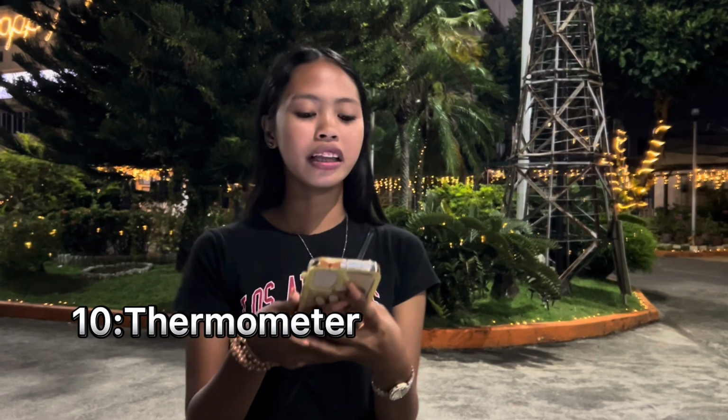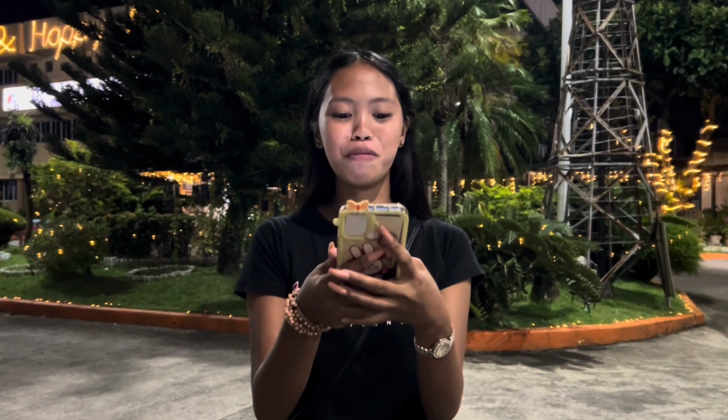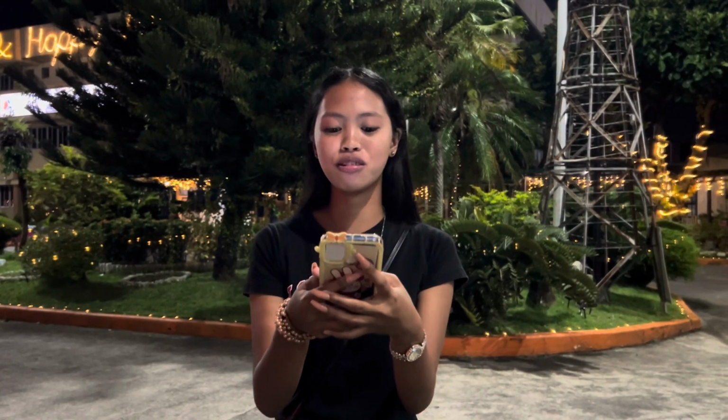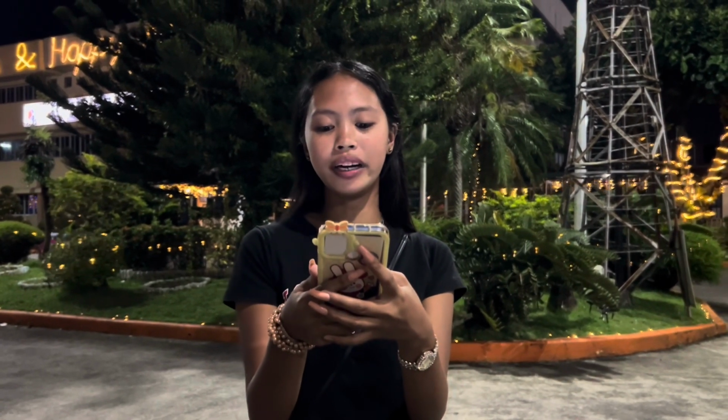And last, thermometer. Every lab is equipped with a basic thermometer, as many times certain chemical or biological reactions can be carried out only in a particular temperature range, and so to proceed, the thermometer becomes very necessary to measure the temperature of the required solution before moving forward with further reaction procedure.